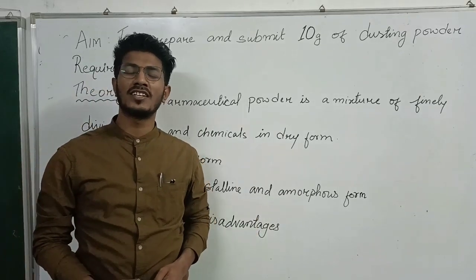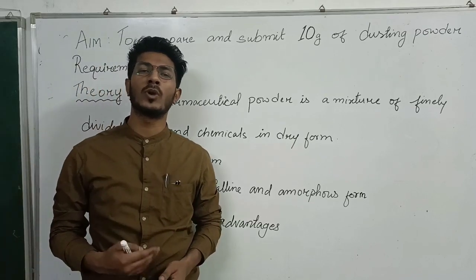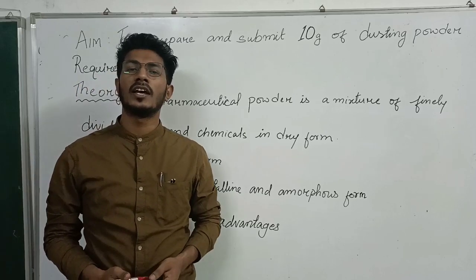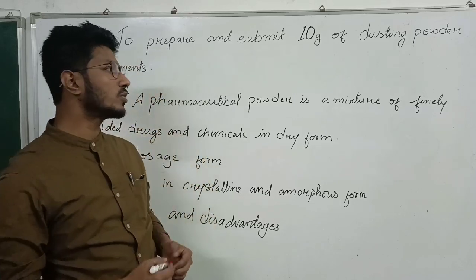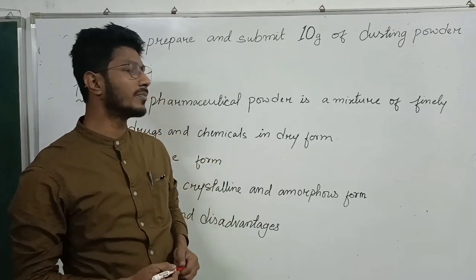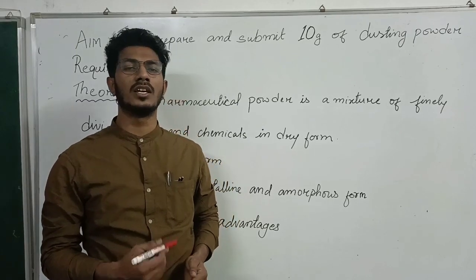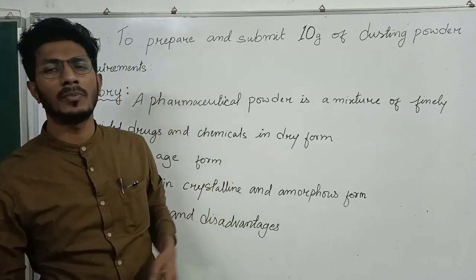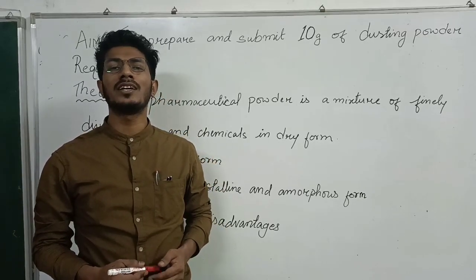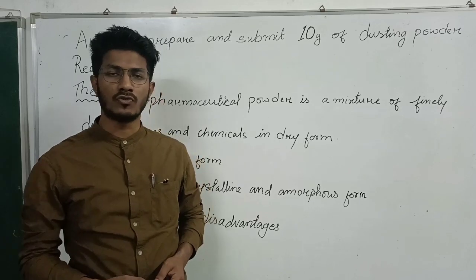There are various advantages and disadvantages of powder. To mention some of the advantages, पहला advantage ये है कि ये बहुत पुराने टाइम से यूज किया जा रहा है. That is, the oldest method of dosage form is powder. And apart from that, powder dosage form can be used externally as well as internally. Externally, जो हम लोग अभी बना रहे हैं dusting powder, that is for external purpose, and powders for injection are used as internal application. उसके अलावा another advantage is that they can be easily carried from one place to another, which is more difficult in case of your liquid dosage form.